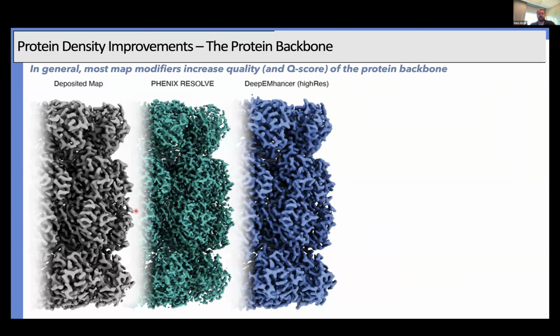And so for our first example, we took the T20S proteasome, which we've been studying by cryoEM for over a decade now because it's a very good benchmark protein.